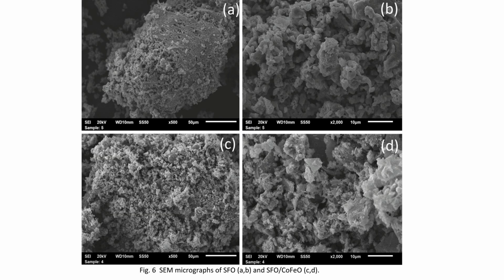Figure 6 shows the SEM images of the strontium hexaferrite and composite of hexaferrite CoFe₂O₄ samples. The image shows the grains with a wide distribution of particle sizes for samples. Figures 6a and 6b for the SFO sample show two morphological forms. The first one is small cylindrical agglomerated forms that look like sponges. In the second one there are hexagonal pellets that are also more compactly agglomerated. These forms are characteristic of hexaferrites. Meanwhile, the SFO-CoFe₂O₄ sample, as shown in figures 6c and 6d, is shaped like a compactly agglomerated sponge.